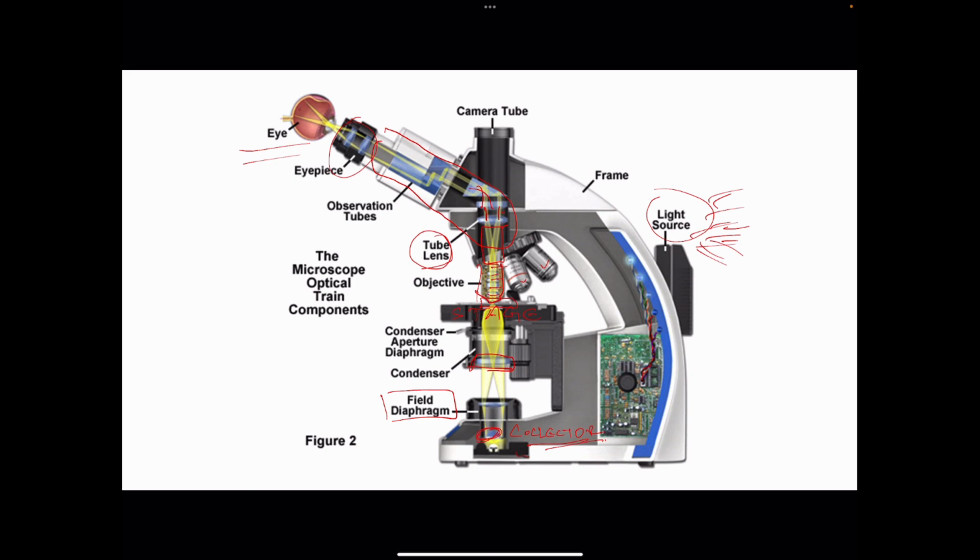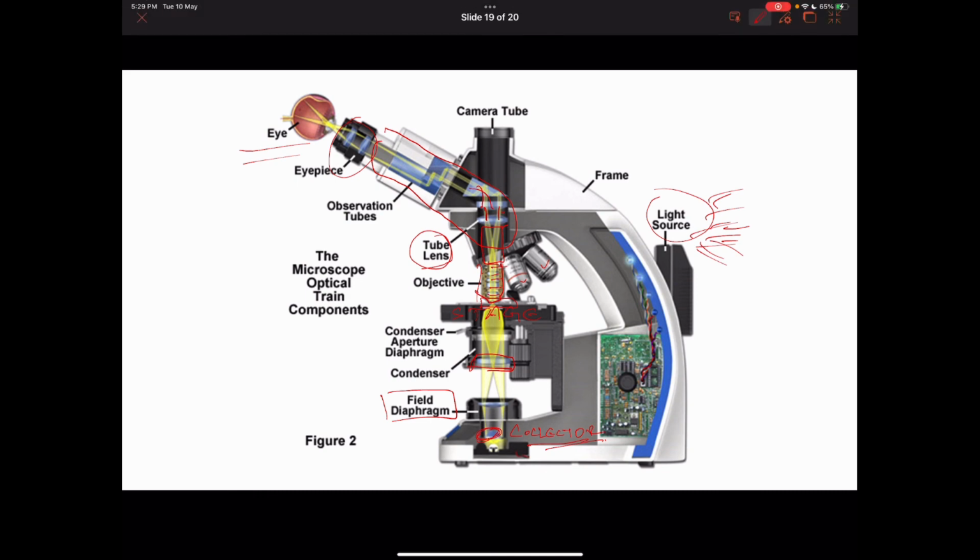I hope with all this introduction and with all these topics thoroughly gone into it, you can acknowledge how an infinity space is created between the eyepiece and the objective by introducing the tube lens, which is of great application in today's or modern day microscopy. Also, we were able to see how an optical train in the compound modern day microscope is followed and how it looks like.